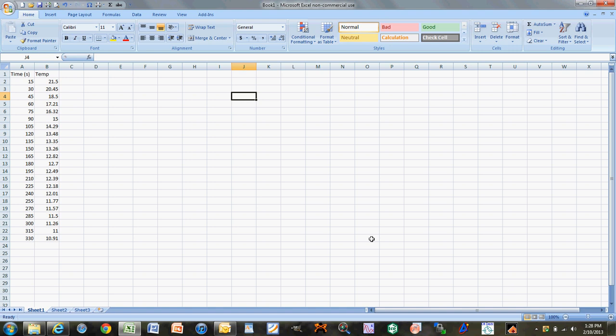Today I'm going to show you how to take the data from your second experiment for General Chemistry 2 — the freezing point depression lab — and use Excel to find the freezing point of both your pure solvent and your overall solution.